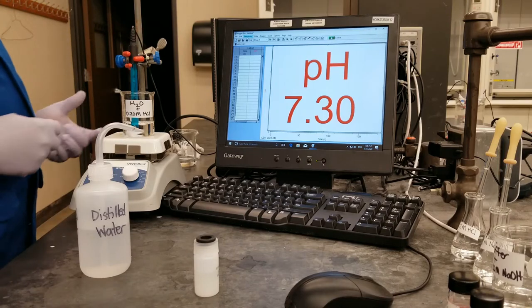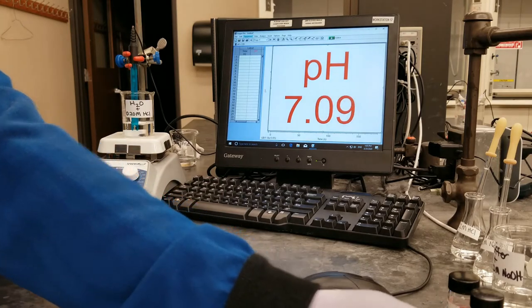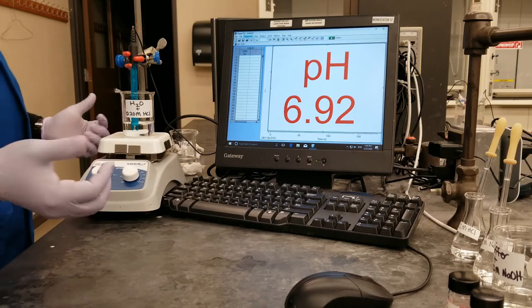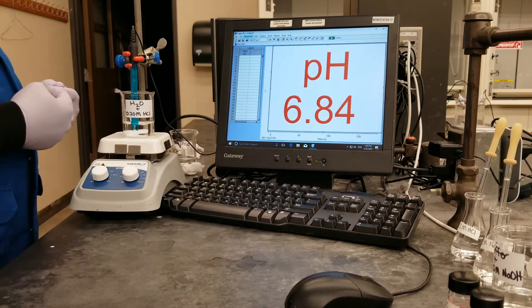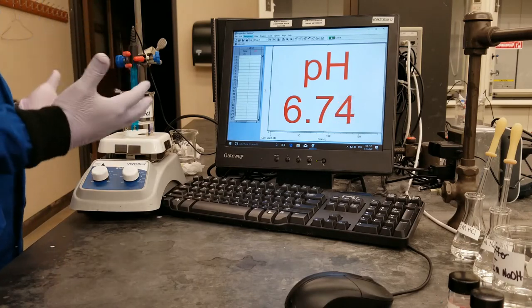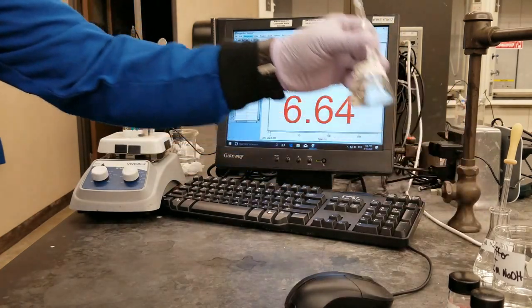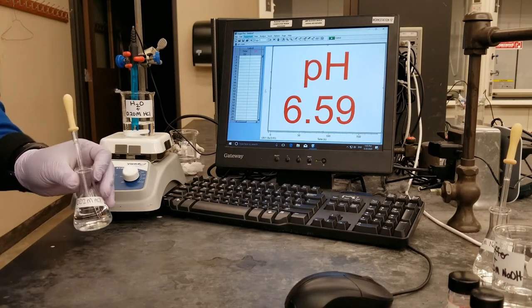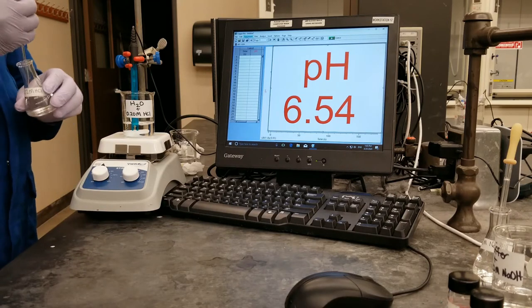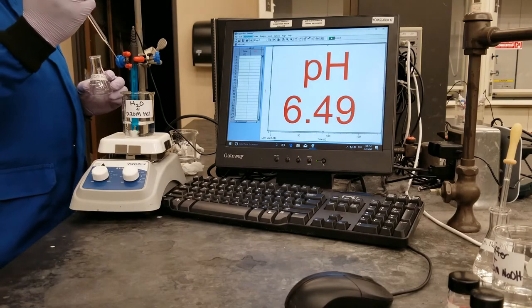Now if you look at my beaker, you will notice that I have a stirrer in there. I have put the stirrer in there because since we are going to be adding drops of the hydrochloric acid, the buffer, and the sodium hydroxide into the solution, we want it to be thoroughly mixed so that we are measuring the actual pH while it is thoroughly mixed. So to begin, I am going to be adding the hydrochloric acid to the water solution. And like the manual says, we are adding 10 drops first.